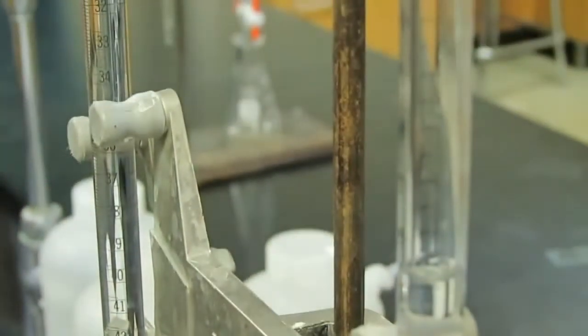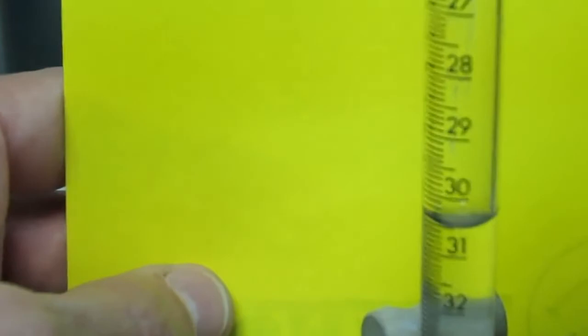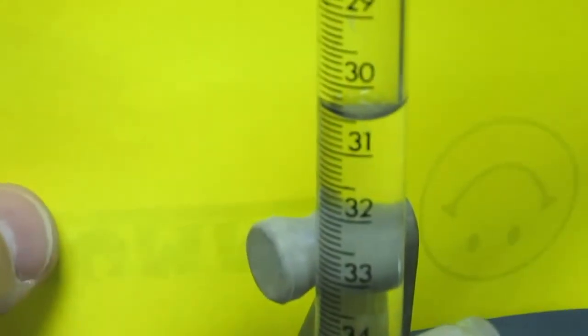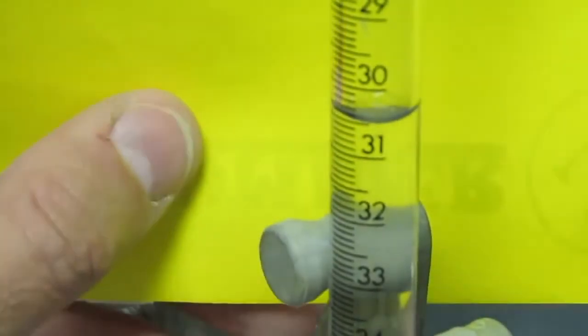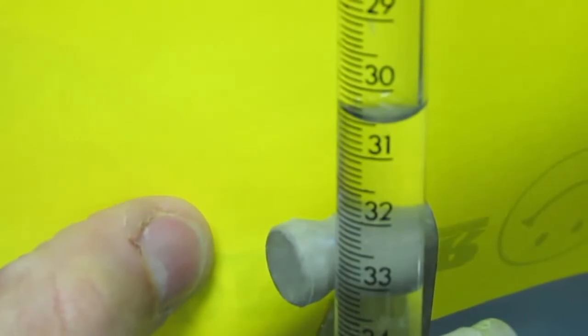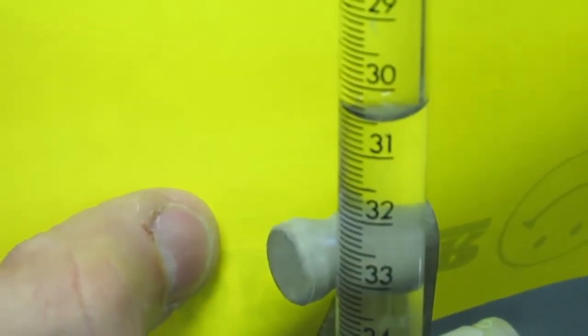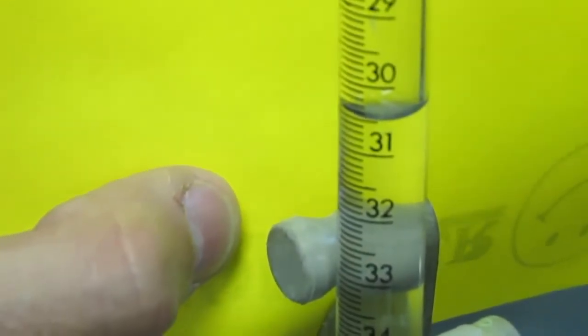So we'll look at the burette again to make sure we can read this. So it looks like we're between 30 and 31. So it's going to be 30 point something, not 31 point something. So we can estimate 1 digit. Looks like it's a little bit more than 30.5. I'm going to go 30.55 as my final base reading.